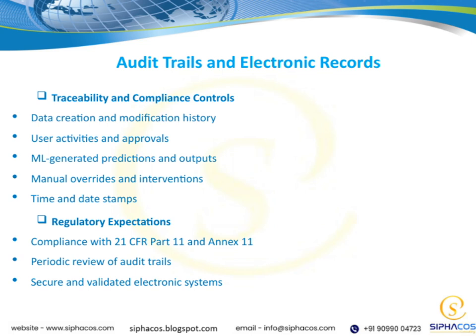Speaking of regulations, compliance with standards like 21 CFR Part 11 and Annex 11 is non-negotiable. These regulations specify how electronic records and audit trails should be maintained to ensure data integrity and security. Regular periodic reviews of the audit trails are essential to verify that everything remains compliant and that no suspicious or unauthorized activities have occurred.